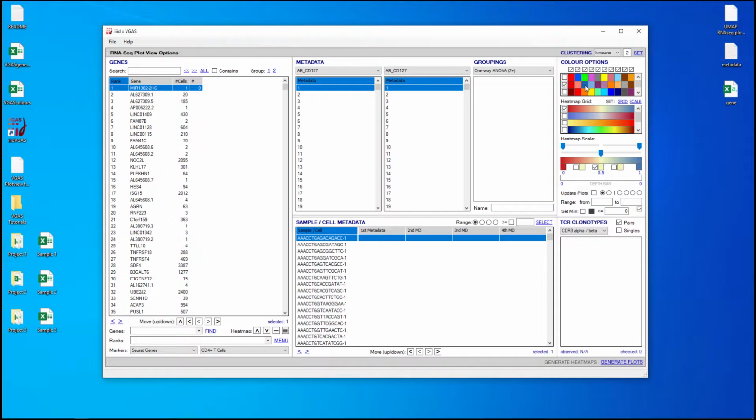To select a set of 10 colors, tick the box next to the row of choice. To exclude a color in the set of 10, untick the respective box along the top. So to exclude green, I would untick this box.